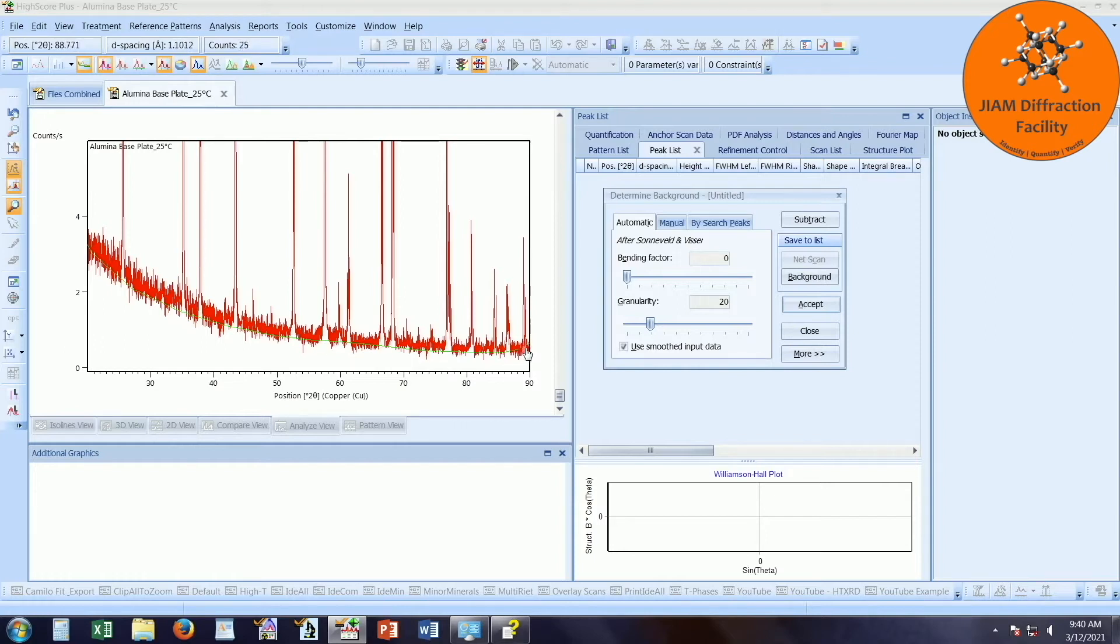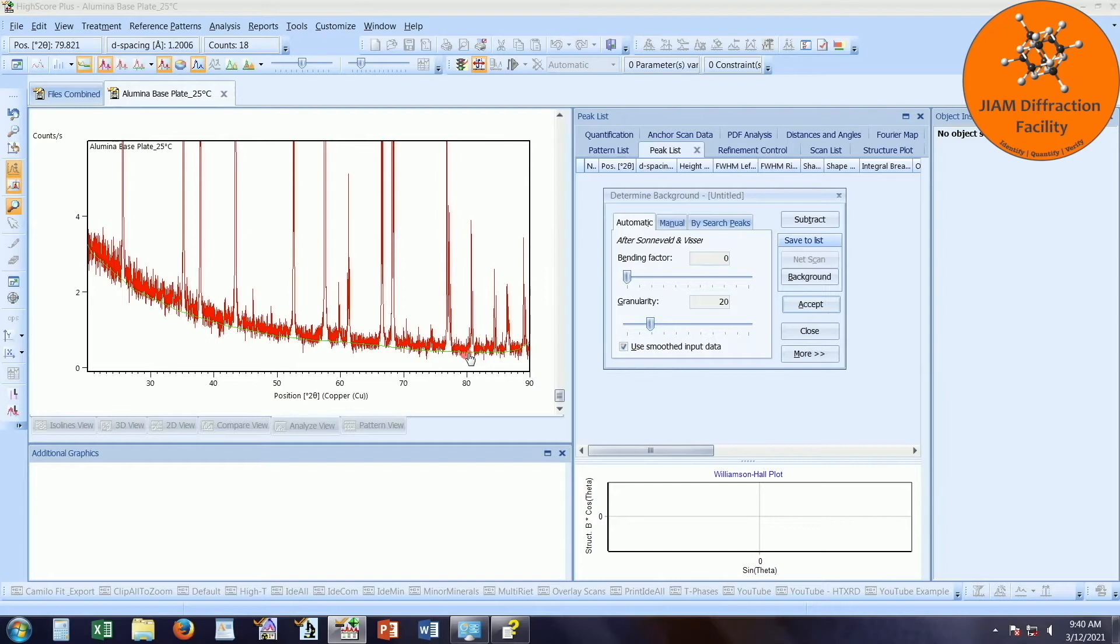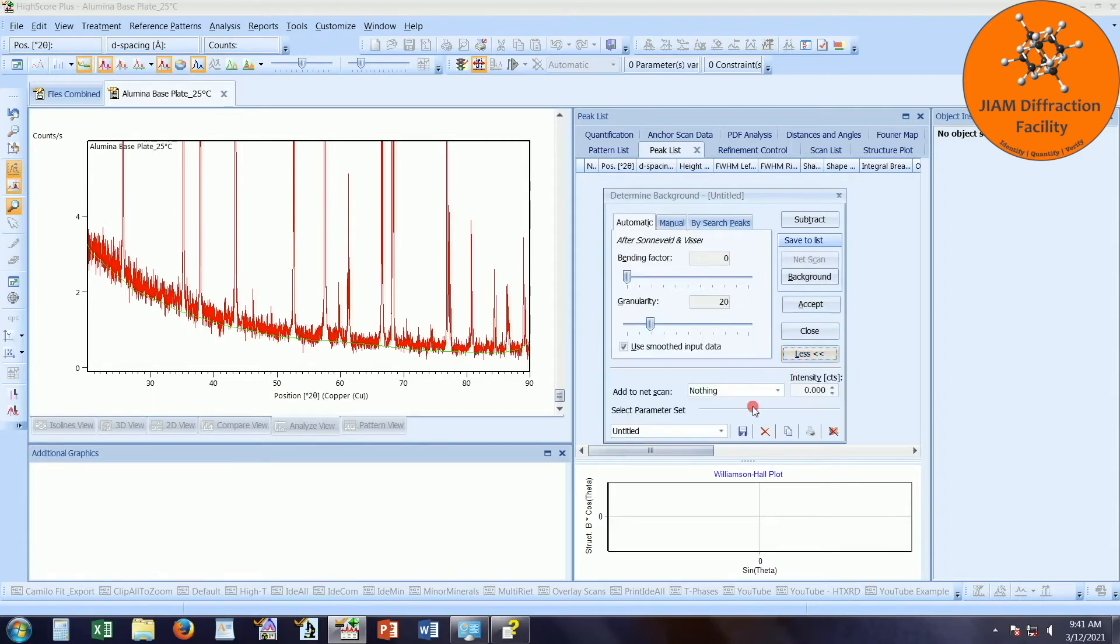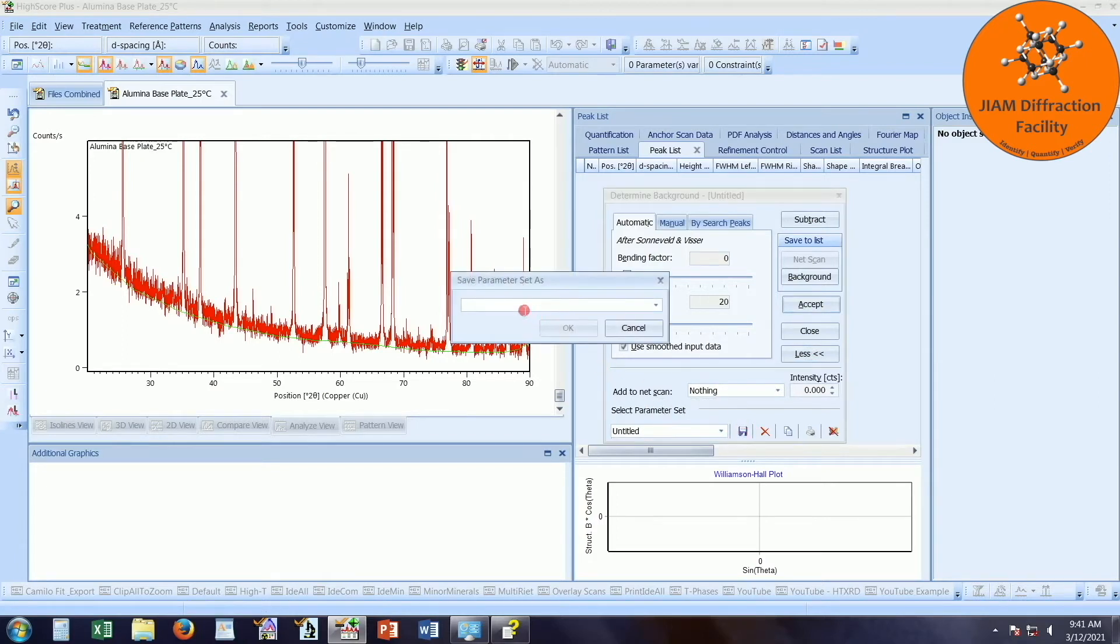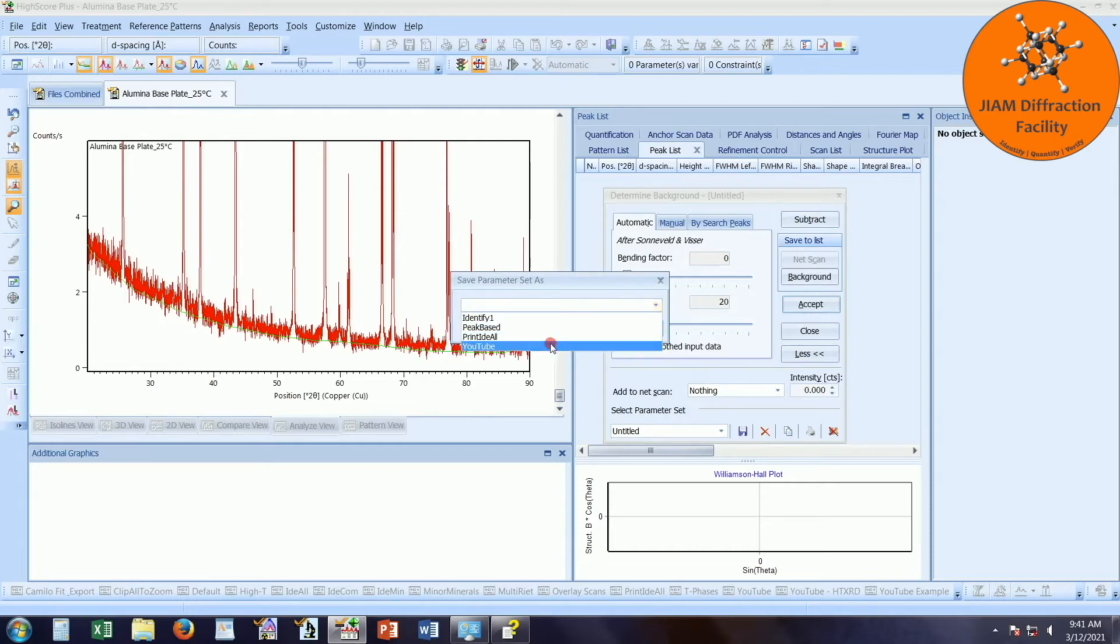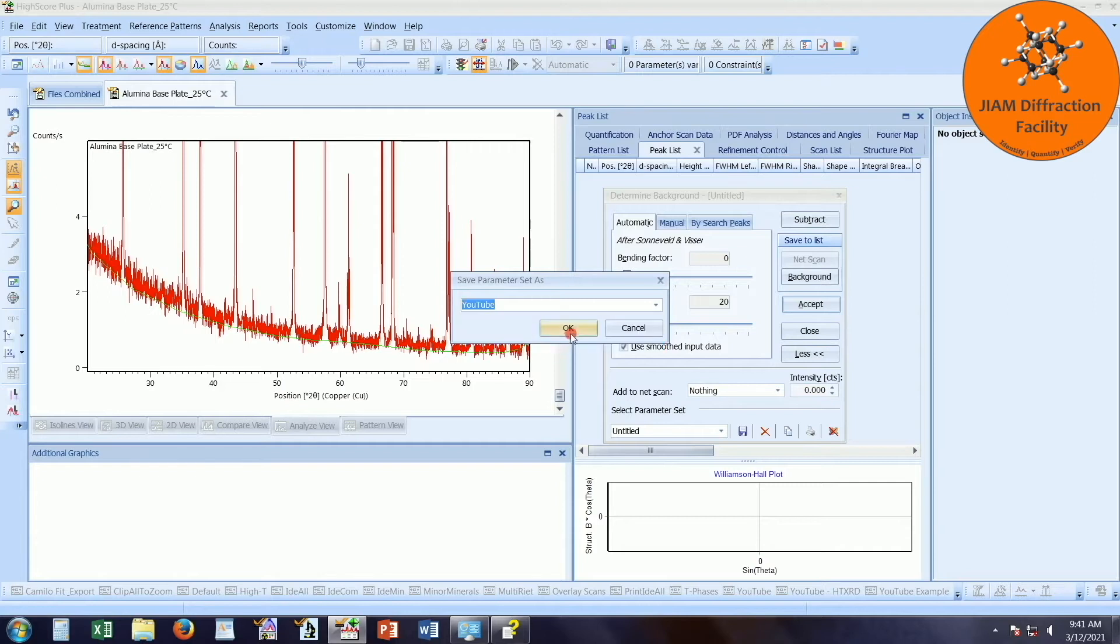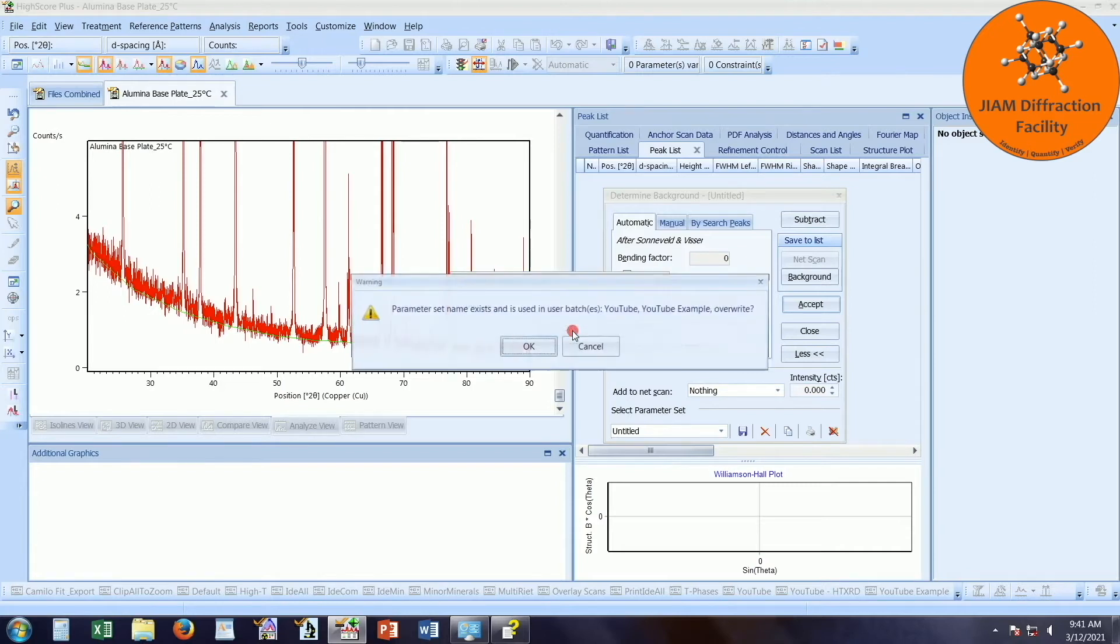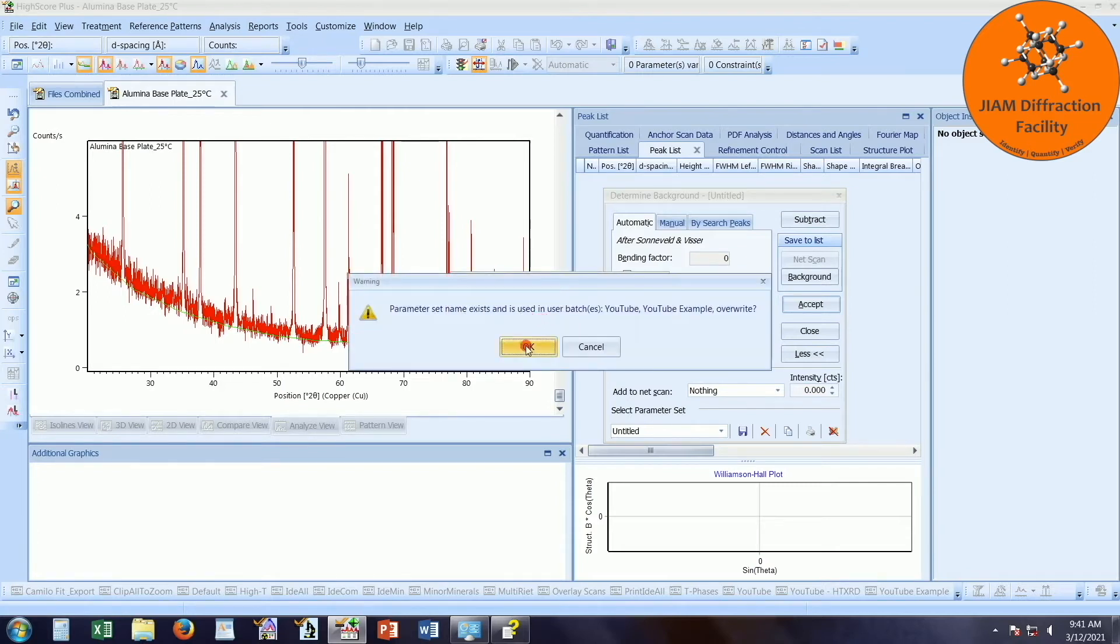If your background all looks about the same for your different patterns, and you know that this background fitting will work well for your patterns, you can left click on this more button. And this lets you save these parameters so that you can use them in the future. So if you left click on the save button, you can type in a name here. I'm just going to choose the YouTube name that I already saved. Click OK. I do want to overwrite it, so I will click OK.